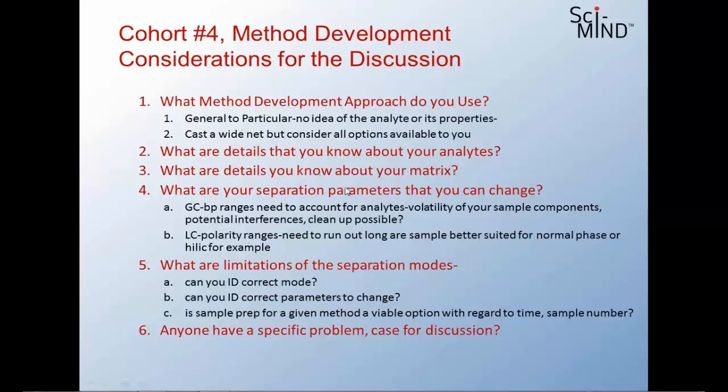You could also, with LC, look at your different parameters to change. For your injector, what's your injection range? For example, what kind of column length, particle size we mentioned, how mobile phase changes. All of these things change selectivity, as Nick had mentioned, in order to get maybe better separation. Change your pH in reverse phase, yep, absolutely.